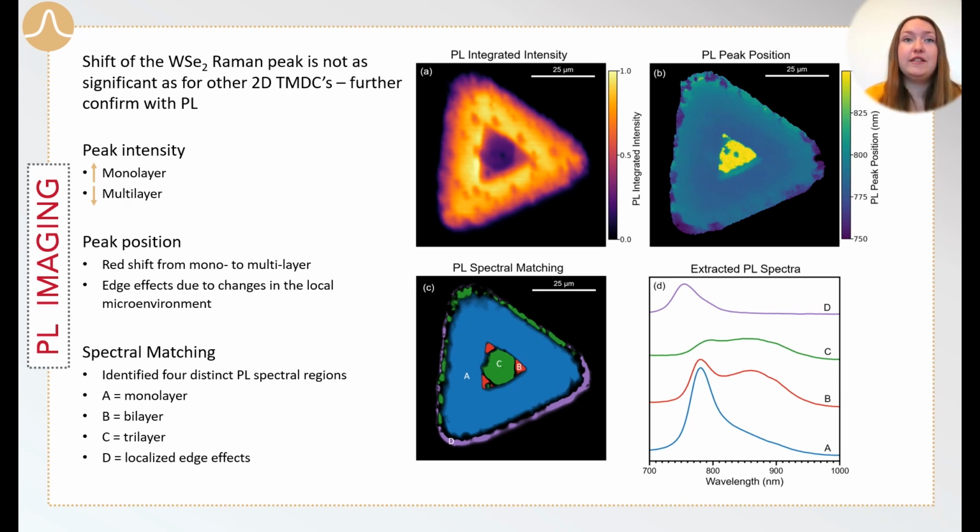Moving on to the areas that do interest us, we see in blue again our monolayer tungsten diselenide. Now this has a photoluminescence peak at 780 nanometers, and it corresponds to 1.6 electron volts. The emission from bulk, which is indirect bandgap tungsten diselenide, occurs at 1.2 electron volts, or 1000 nanometers. So we can use this information to figure out from our peaks of this crystal what is going on in that central area that we know from the Raman is multilayer.